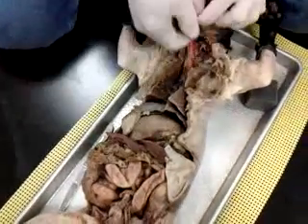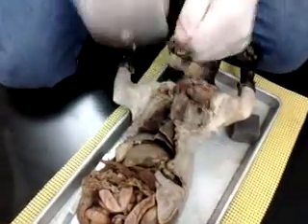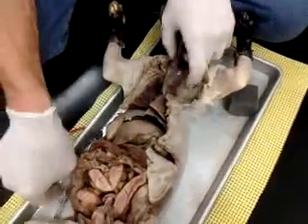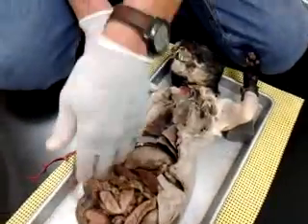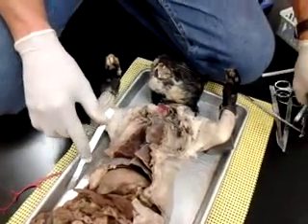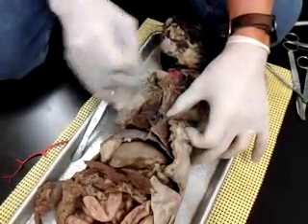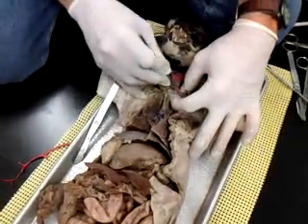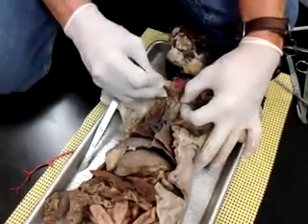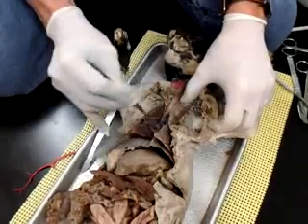Oh, no, this is what's cool. Oh, that one wasn't very good. I got a little bit of the aorta. Oh, I don't want to ask you about that. Oh, come on. Ugly. I can bend down. Okay. Does that help? Yeah. Thank you. Tall people in the back.